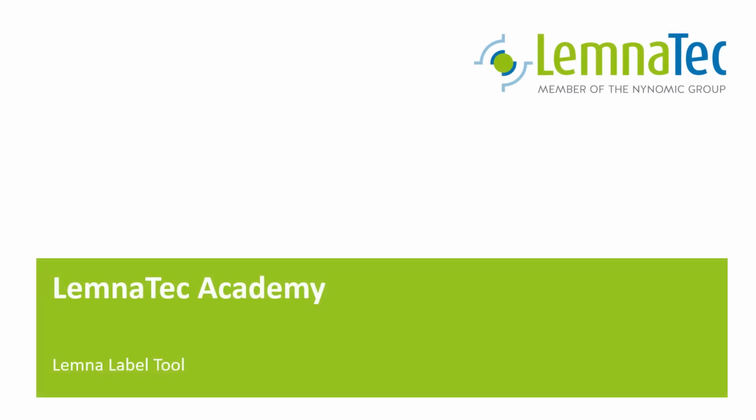In this video, I will give you a deeper insight into the Lemna label tool. You may start the label tool from the desktop icon or from Lemna Experiment.